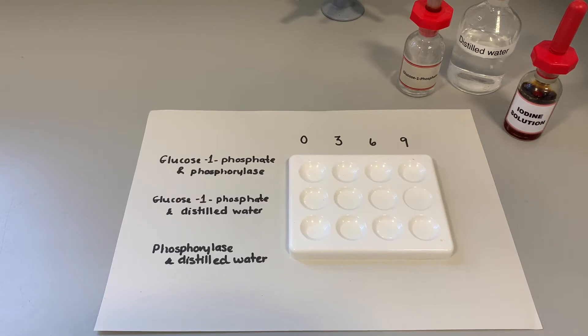We can test for the presence of starch using iodine solution because if starch is present our iodine solution will turn a blue-black color from the original brown color that you can see.